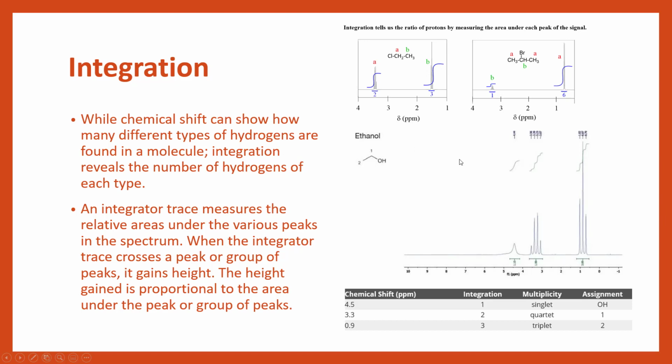If we look at ethanol again, we can work through our structure. So in our ethanol, we have our 3 distinct peaks, okay? So we have a peak for a CH3 group, a peak for a CH2 group, and a small peak here for our hydrogen on our oxygen, okay? Now, with our OH groups and with NH groups, they're not set in stone. They can definitely flip around and move around depending on the solvent we're using.